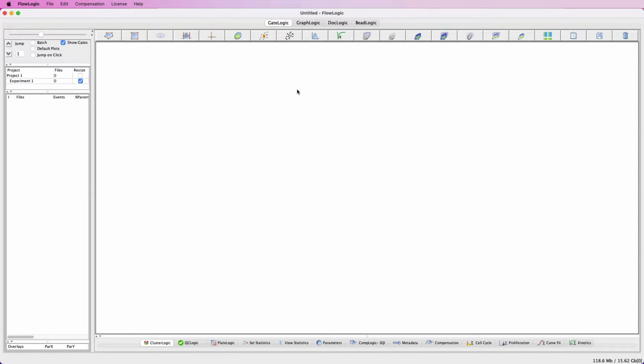So I hope that gives you an idea of what is possible within FlowLogic. And if you do need to use some of these advanced features, please refer to the detailed instructional videos on our website. So now I'll move on to the introductory live demonstration of the software.